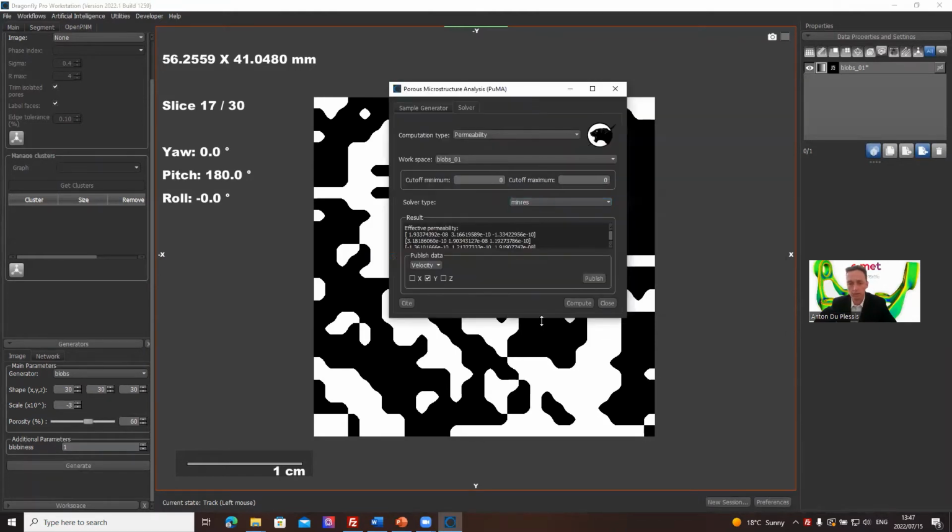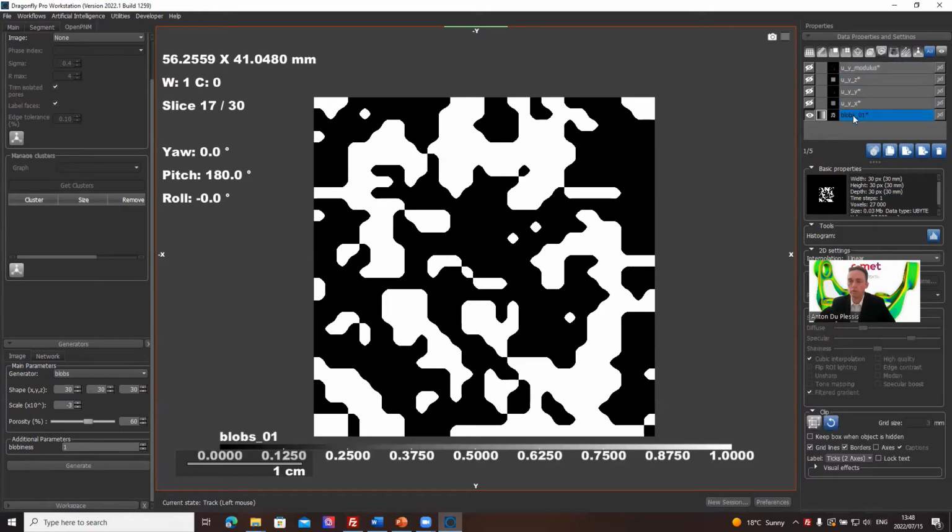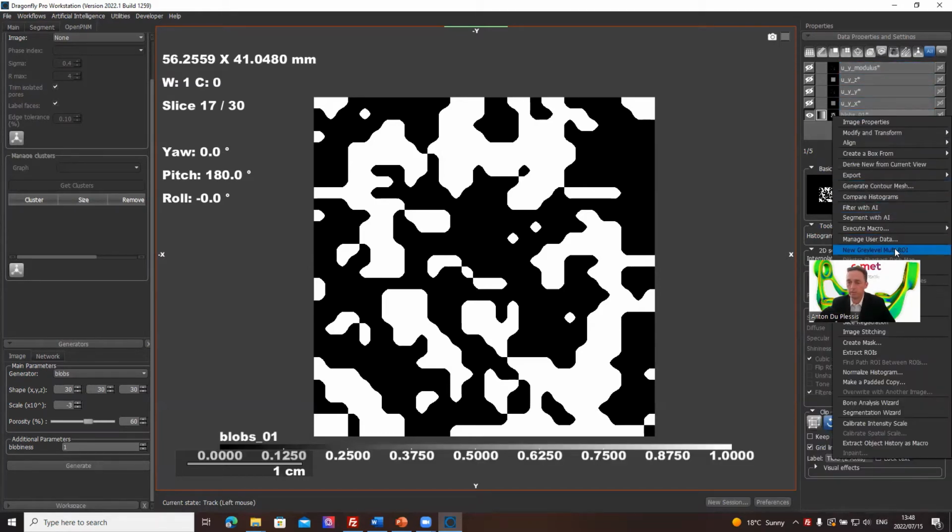After computing, you need to actually publish that. So don't forget to click that button there. Now we have these channels and a modulus channel along the y-axis. So in order to create, we need to, let me see, where is it exactly?